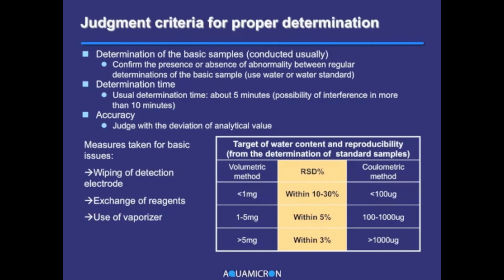I will now describe the routine and practical maintenance of the analyzer and also about abnormal diagnosis. First of all, I would like to recommend again that you confirm that the analyzer works well by measuring distilled water or the standard sample before and after the actual sample measurements.